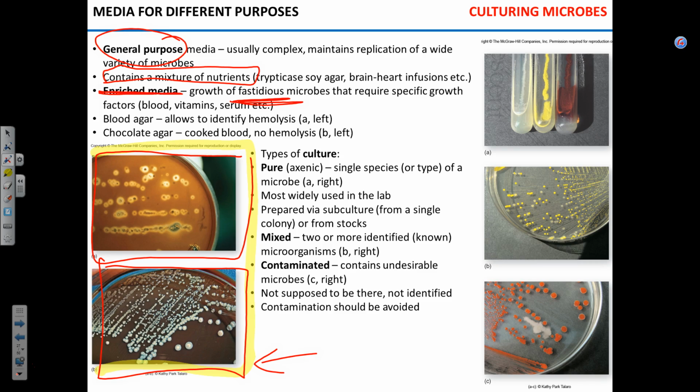And actually, you can see here the colonies. It's the microbe called Neisseria. I can guarantee that you've heard of two common diseases that different species of Neisseria genus cause. One is gonorrhea. Neisseria gonorrhoeae causes that sexually transmitted disease. And another is meningococcal infection. Neisseria meningitidis causes meningitis. Surprise, surprise. One of the most severe forms of bacterial meningitis that we know.